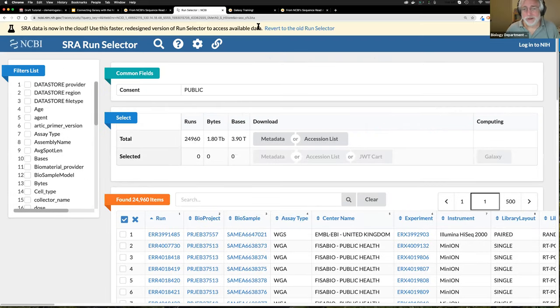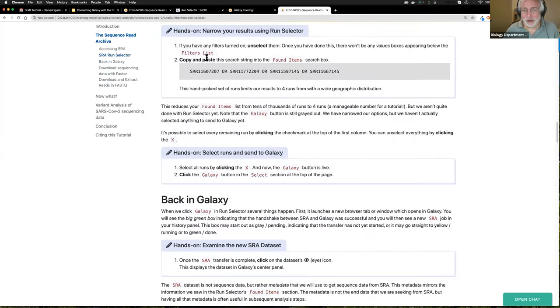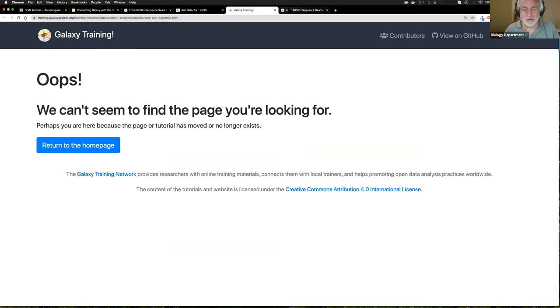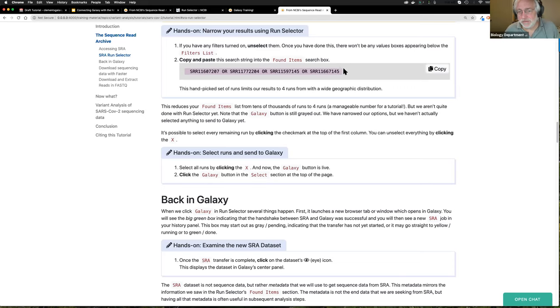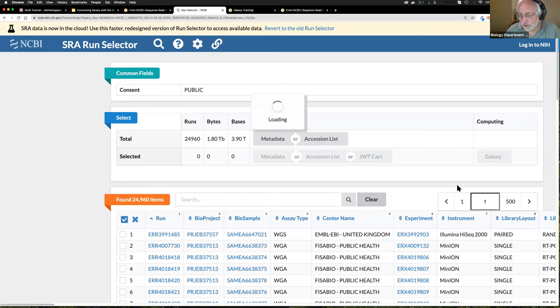Since we're running a workshop, we're not going to do complex queries — we're going to get a very small sample by pasting specific accessions into the found-item search box. In reality you wouldn't do this; the Run Selector exists for sophisticated queries. We have four hand-picked items preselected to get geographic variation for the tutorial. Note that the Galaxy button is still not highlighted — we need to select items first. I'll click 'Select All' to select all four shown.